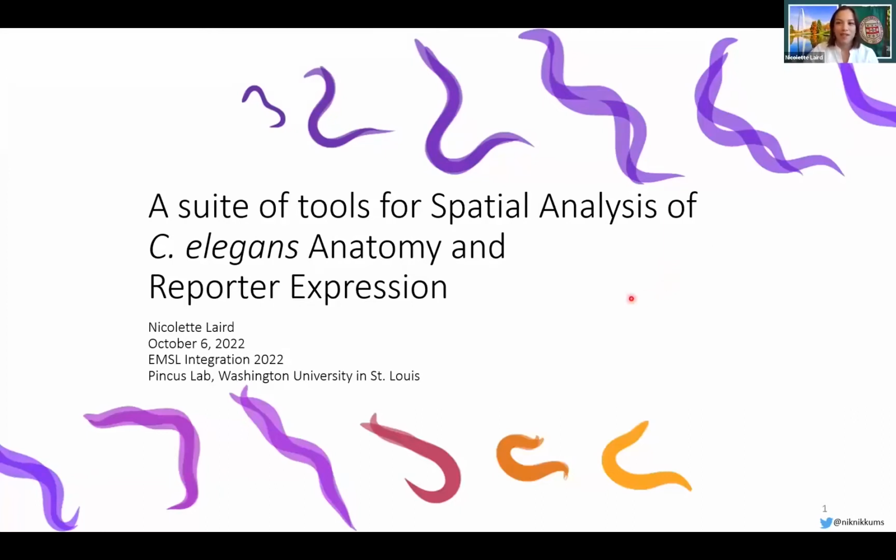I'm actually in St. Louis, which I think is really apt because I will be talking about the suite of tools that I developed while I was a grad student in the Pincus Lab at Washington University in St. Louis. In the Pincus Lab, we were interested in studying the aging process in C. elegans. Specifically, we're interested in answering the question of nature versus nurture and individuality.